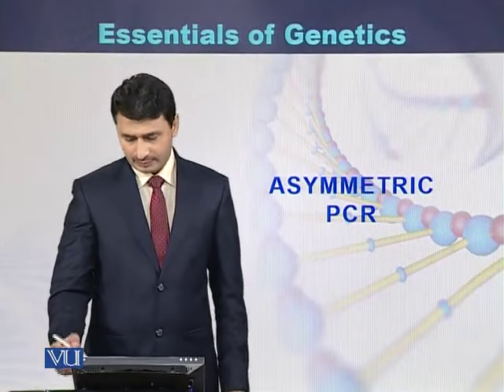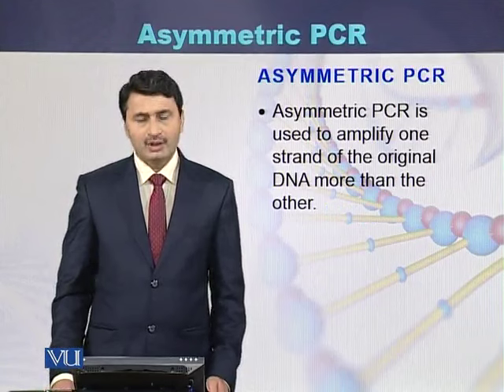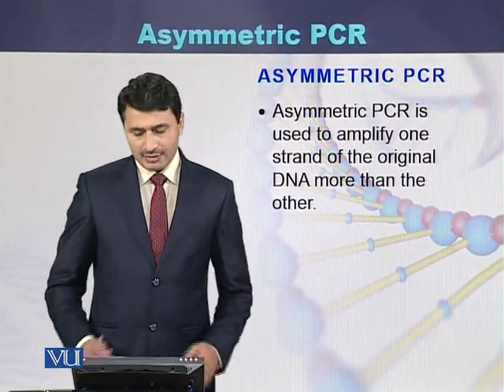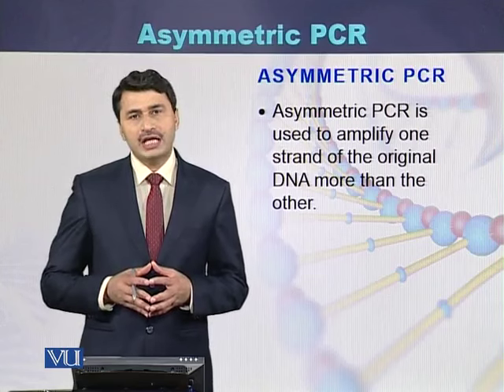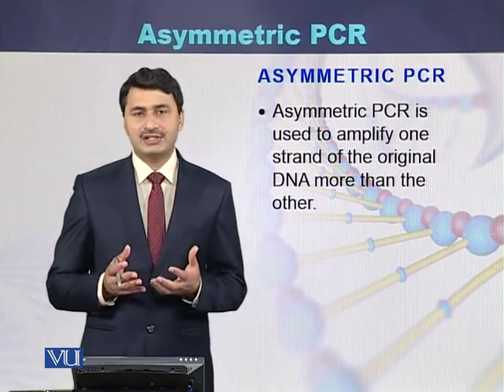Asymmetric PCR. Asymmetric PCR is used to amplify one strand of the original DNA more than the other strand.